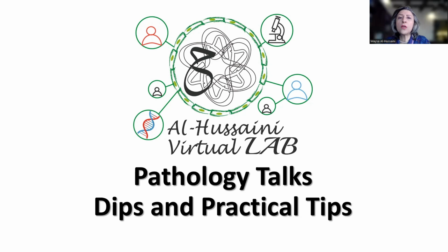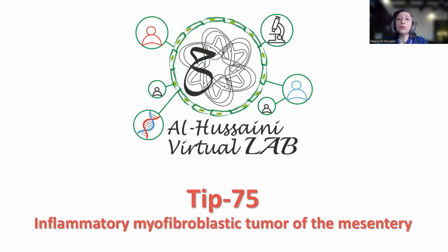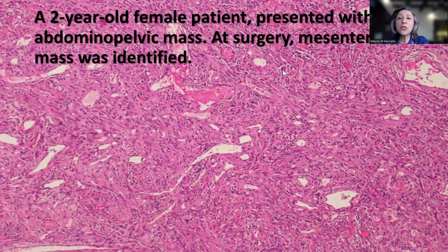What I'm going to be sharing with you today is an interesting case of inflammatory myofibroblastic tumor of the mesentery in a young child. So this is a 2-year-old female patient who presented with an abdominal pelvic mass noted by the mother. And at surgery, she was found to have a mesenteric mass. And this is the low power magnification of the mesenteric mass.